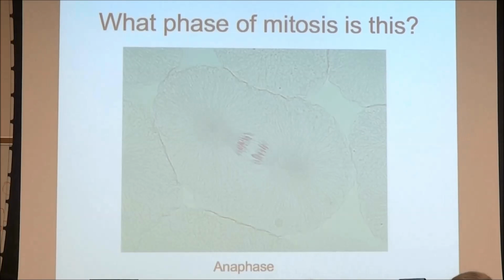Anaphase. Good. How'd you know it was anaphase? Yeah, it's pulling apart, right? So it looks like the little fingers in here. They're being pulled apart.